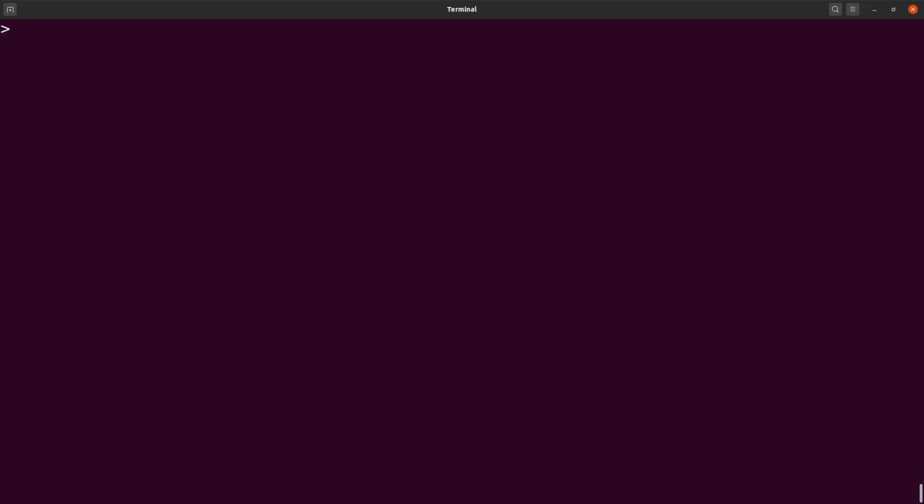So let's proceed. So let's check. We will use the adjusted p-value for this. And let's just first do a head. Let me start with the transcripts.